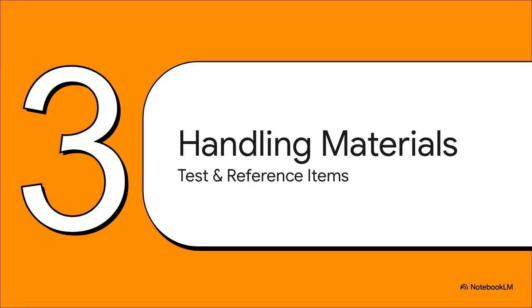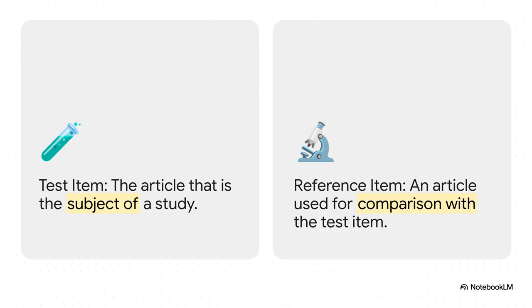All right, moving on. Let's talk about how Apex Labs was handling the actual substances they were investigating. This is a really common stumbling block for a lot of labs when it comes to GLP compliance. So you have your test items, the thing you're studying, and your reference items, which are your controls or comparators. The GLP mandate is crystal clear on this. You must keep them separate. Apex Labs didn't, and that created a huge risk of mix-ups that could make their entire study useless.